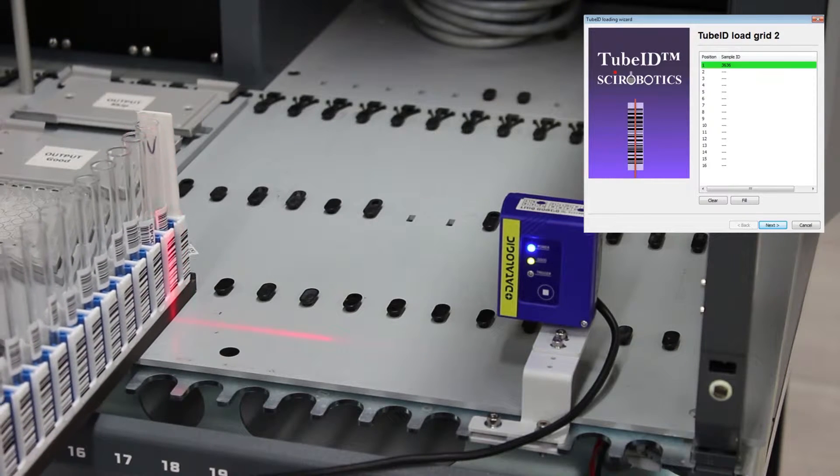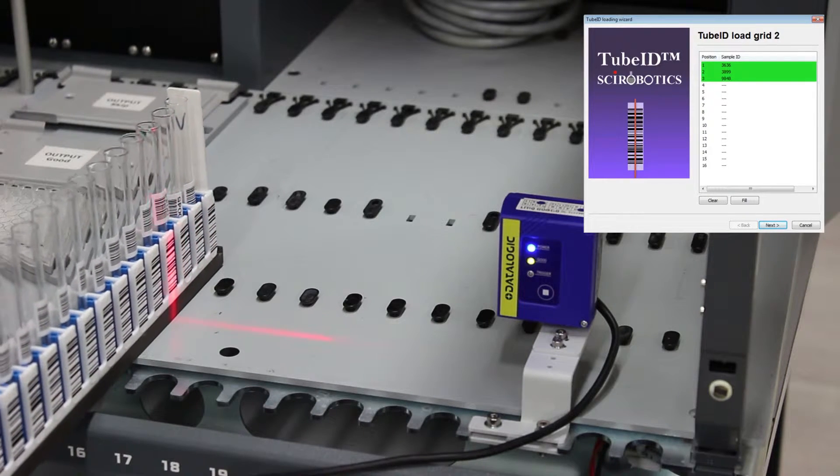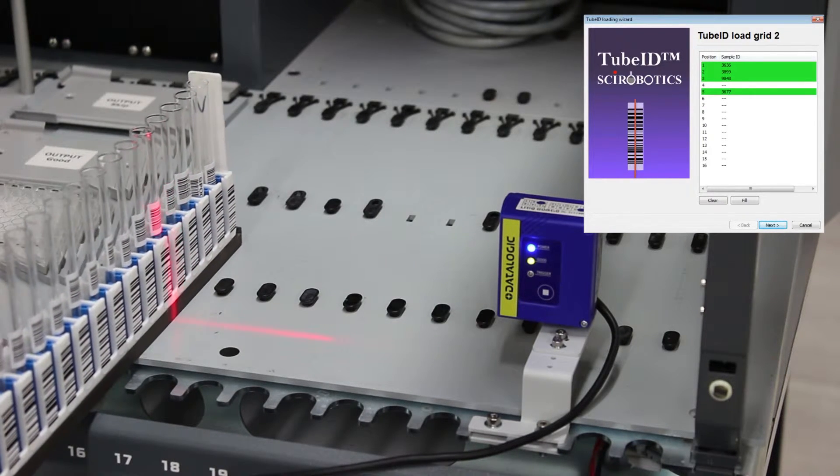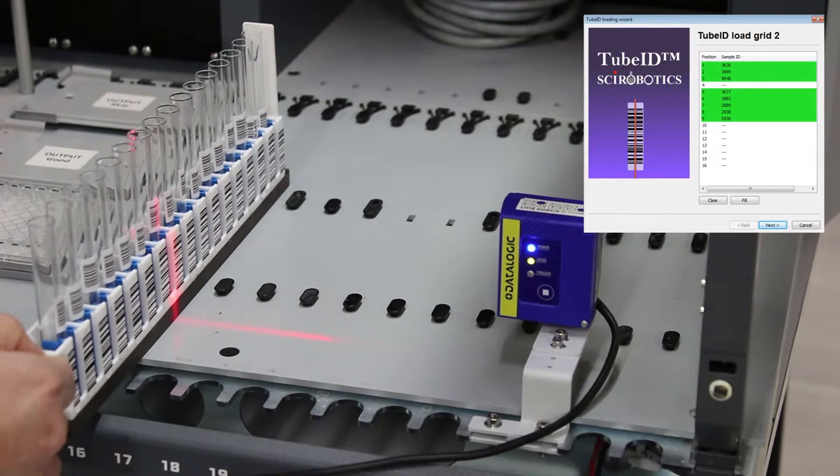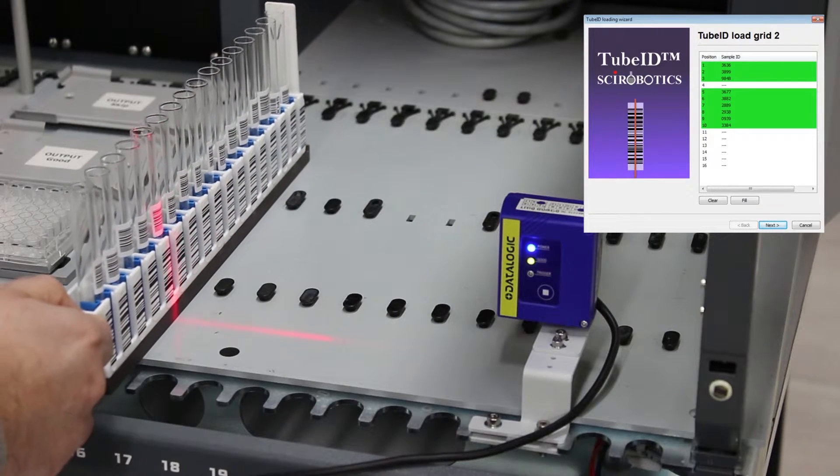Once all tubes in a tube rack are read, click the Next button and continue with the next tube rack.